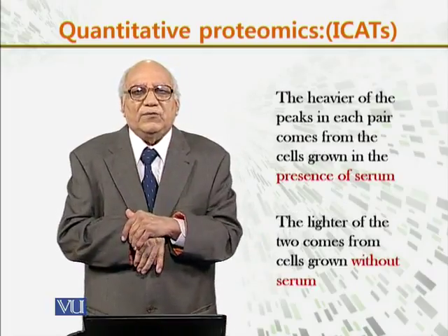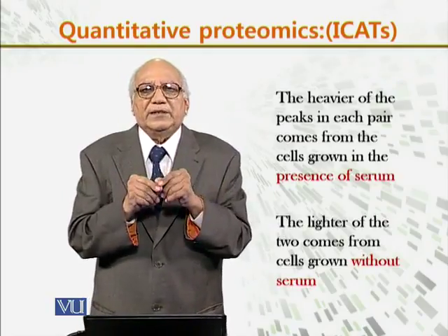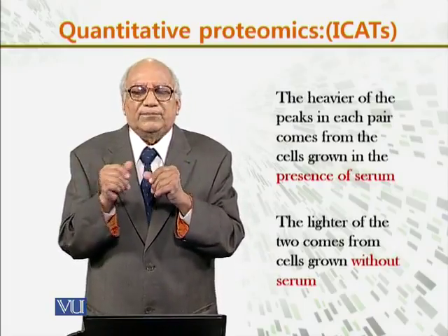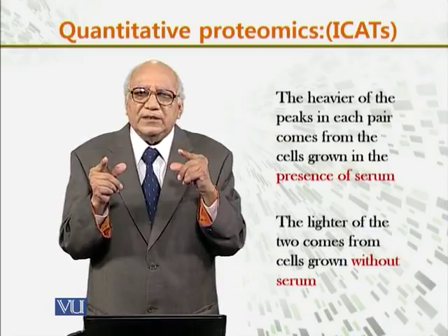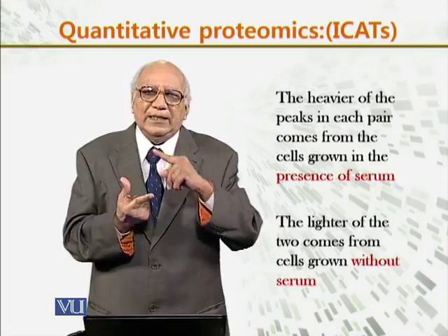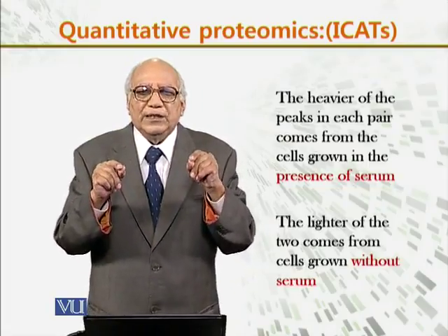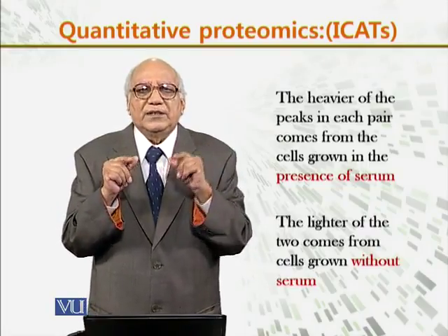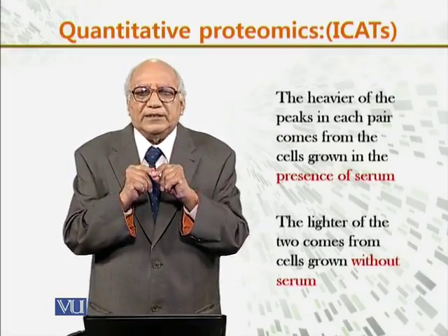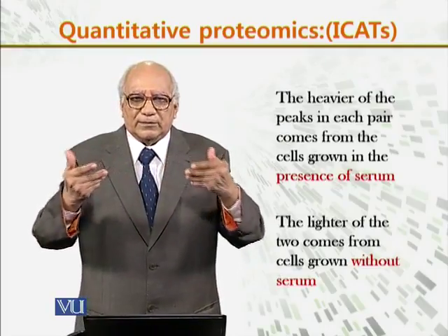Then the heavier of the two peaks in each pair comes from the cells grown in the presence of serum, because the serum provides more energy and more proteins.